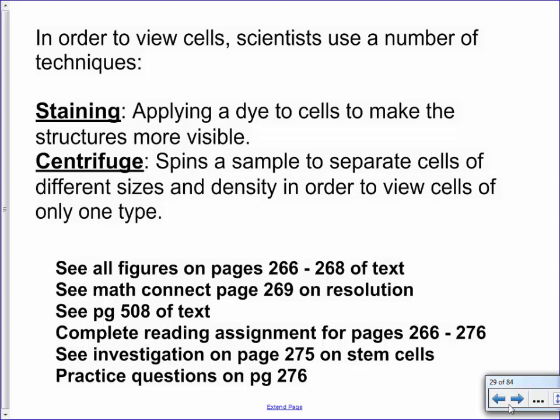Okay. The last technique, I don't have one of these. I have used one of these in chemistry before. It's called a centrifuge. The idea behind a centrifuge, you might have even seen one on, like, say, CSI. You take a vial, and you put the vial into a machine, and it spins around in circles, like wicked fast.